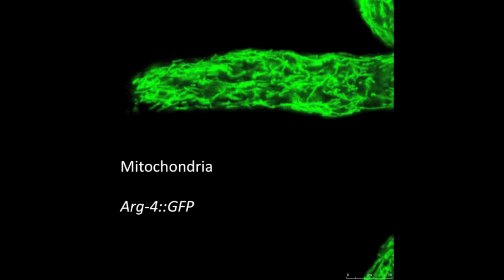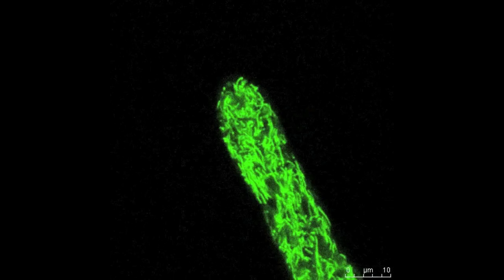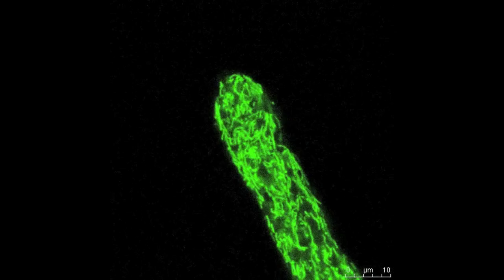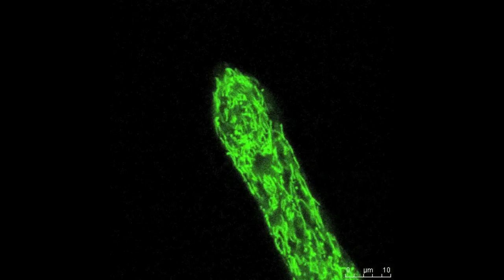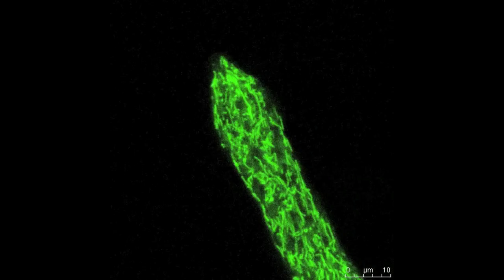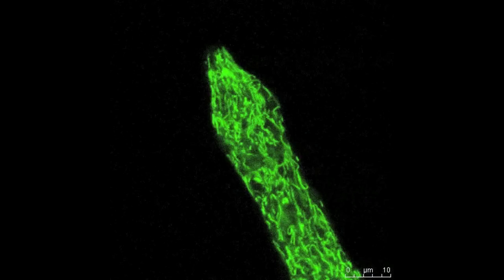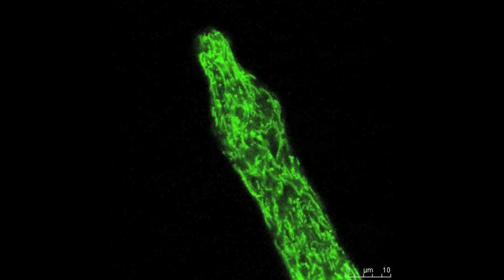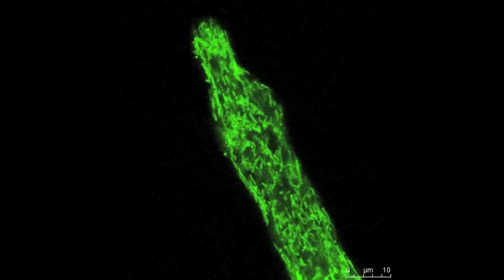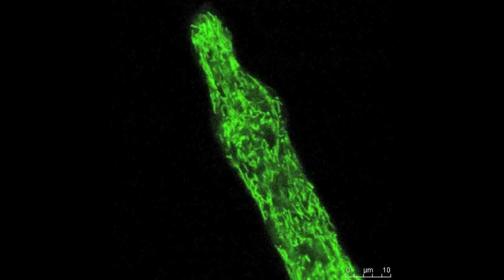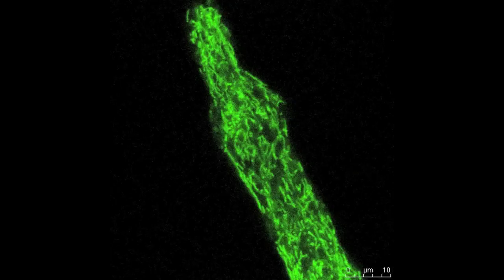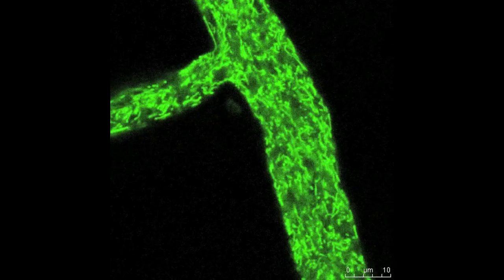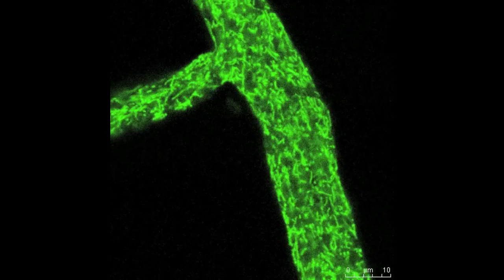Mitochondria produce energy for the cells in the form of ATP. They're probably the most abundant of the organelles. In fact, unlike most of the other organelles, we see lots of mitochondria, even in the most apical parts of the hyphae, right up at the hyphal tip. Mitochondria look like thin little worms, and they're usually aligned with their long axis, parallel to the long axis of the hyphae.